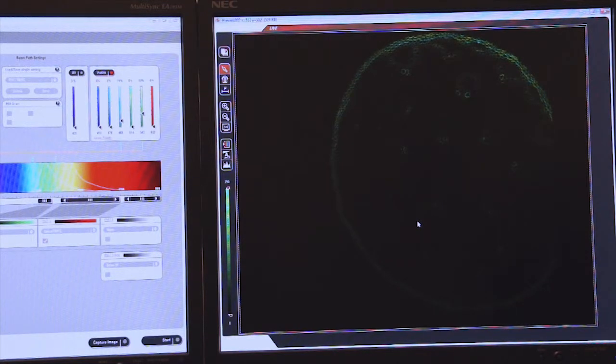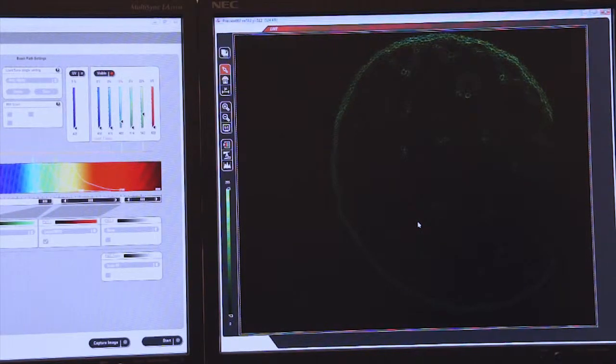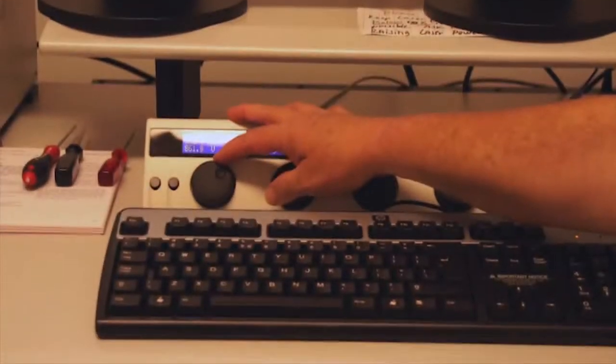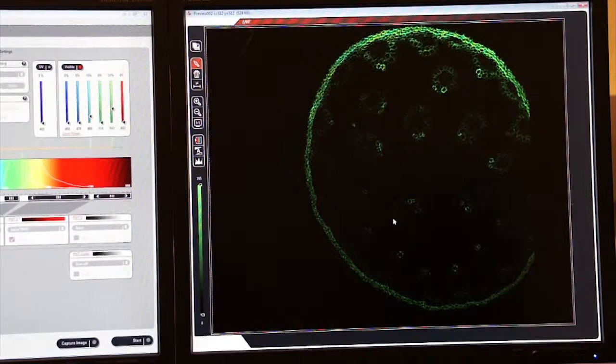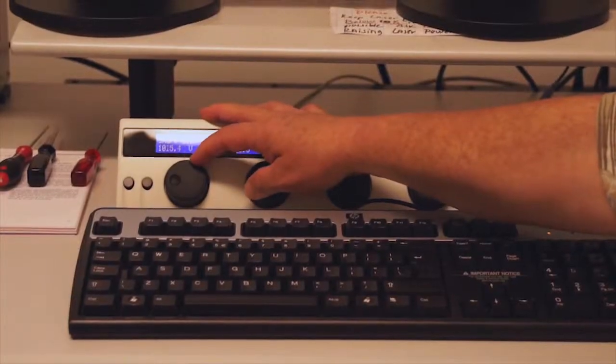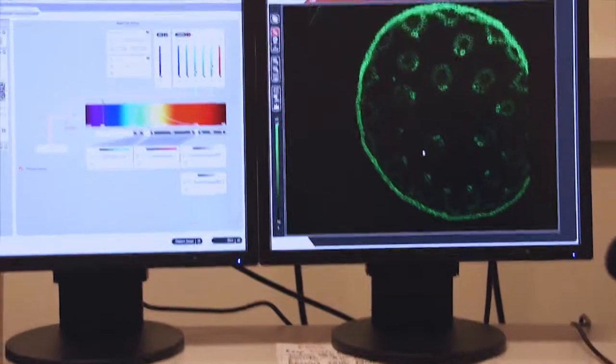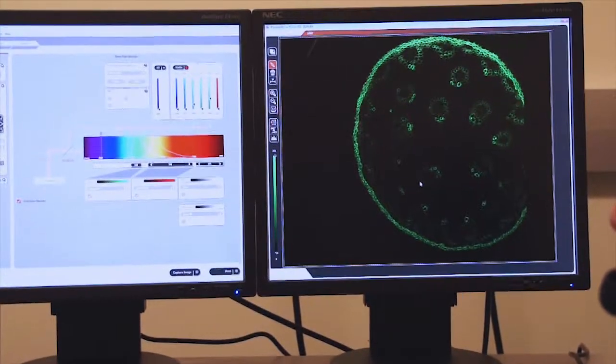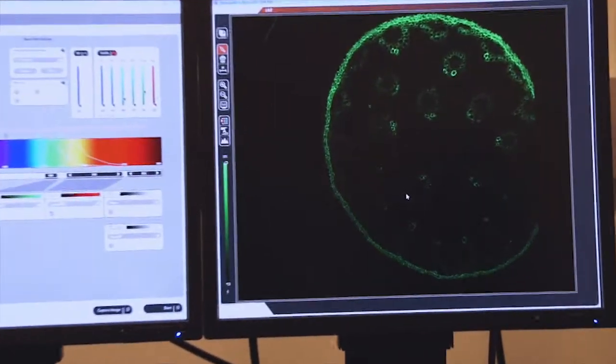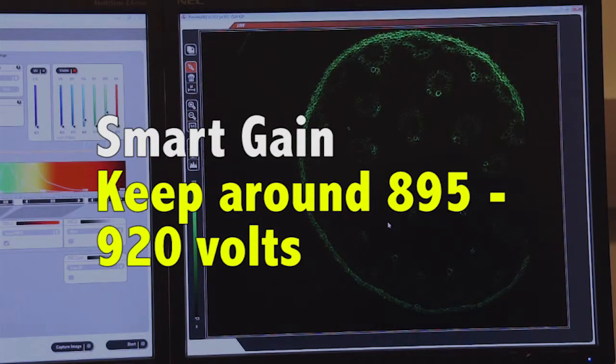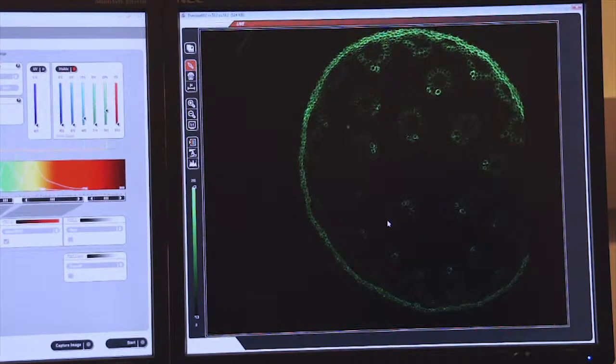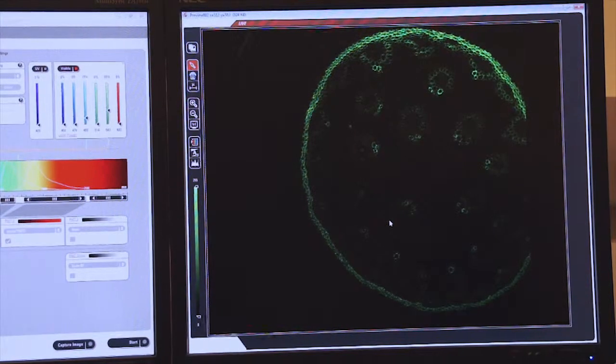At this point, we want to increase our smart gain using our toolbar, which is on the desktop. So we dial the smart gain up, and as you can see, the image becomes brighter and brighter. Rule of thumb is to have the smart gain somewhere between maybe 895 and 920 volts. That gives us a pretty decent image at that wavelength.